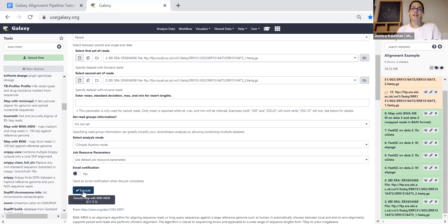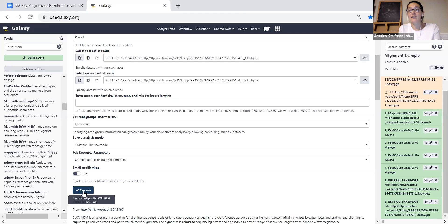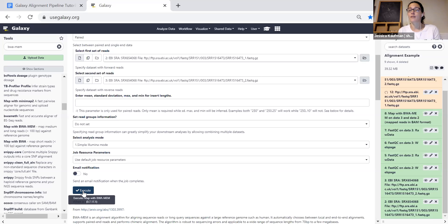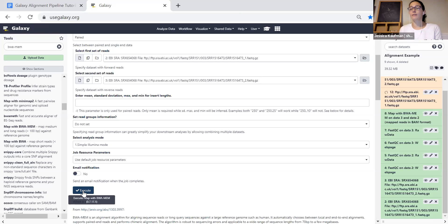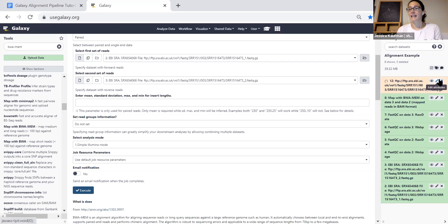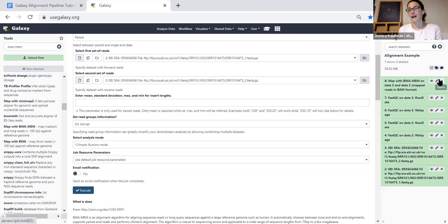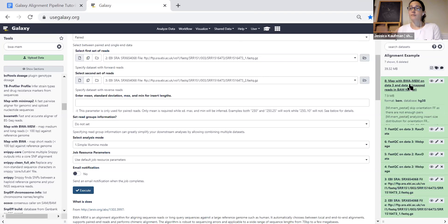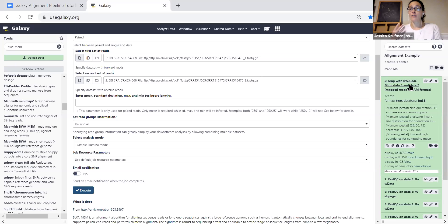This job will take a long time to run. It may actually even take a day. It depends on how many people are using the Galaxy server, which depends on things like snow days. If a lot of people are snowed out and unable to get to their lab, they instead of doing bench experiments will work on bioinformatics experiments. Once your job has loaded, it will turn gray, which means it's waiting to go to the server and turn yellow while it's running. You can see on the right hand panel how my loading of data is still running. I'm actually going to cancel it because I don't need a second copy of this data. Once it's done running, it will turn green and you're ready to get the data for uploading to Canvas and submitting your assignment.